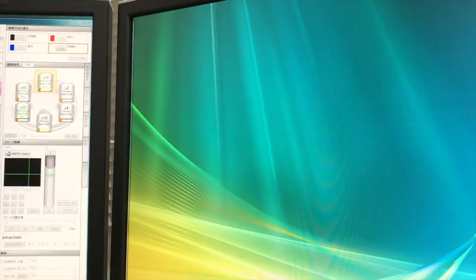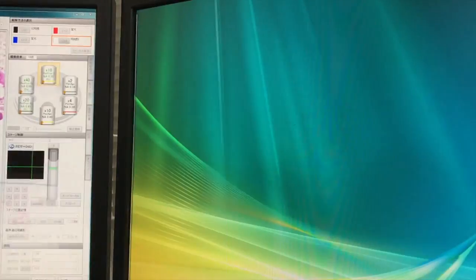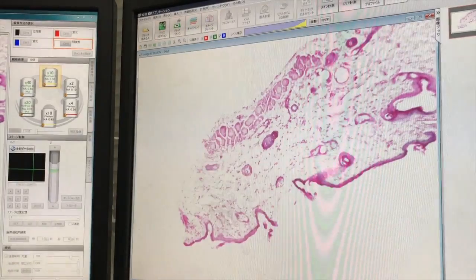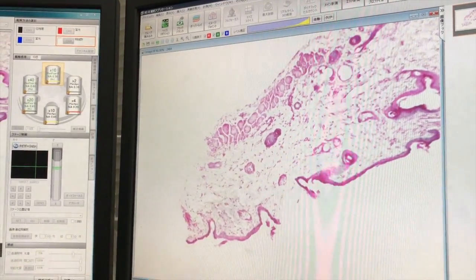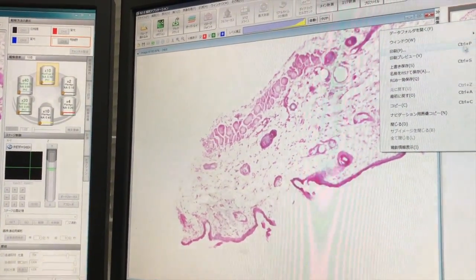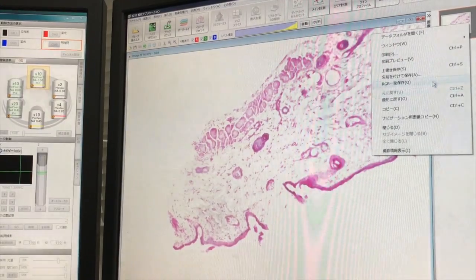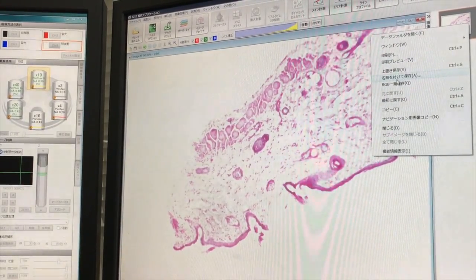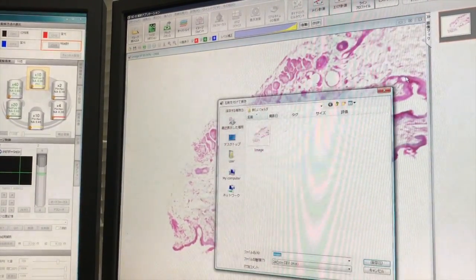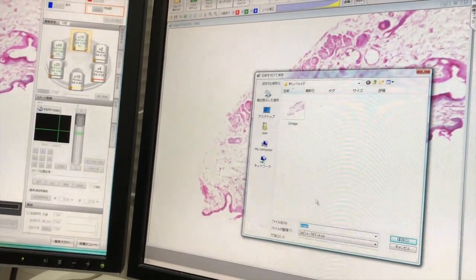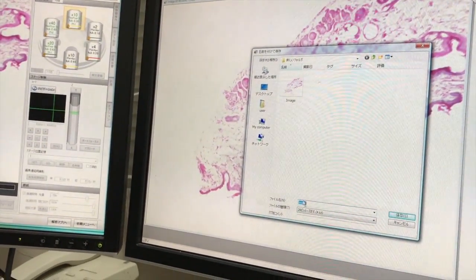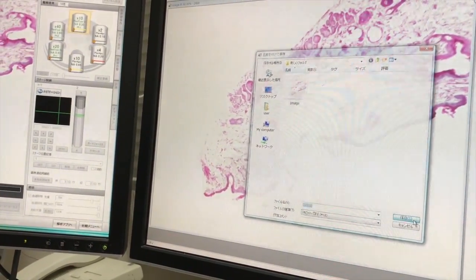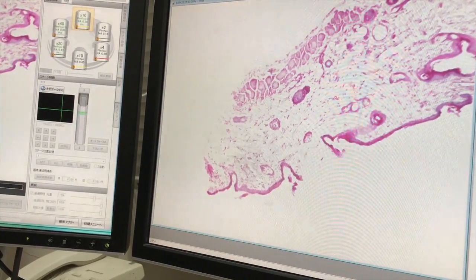You already set... Which folder? You already set the folder. You just set it now. You can save again. You can just right click. And press... This one. This option. This is save as. You can save it to a different name or something. Okay. And save. It will be saved in your folder.